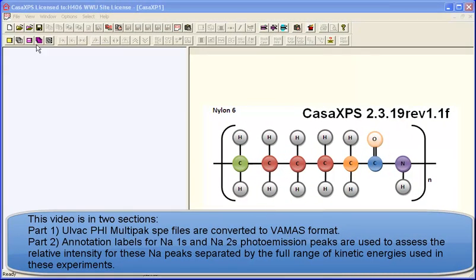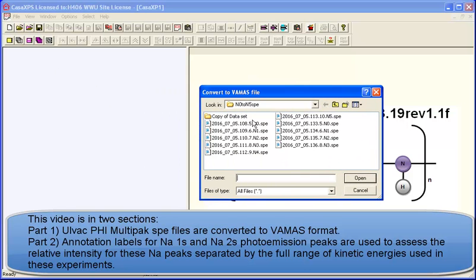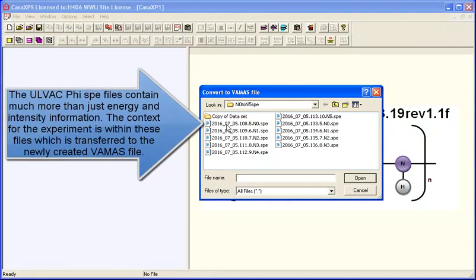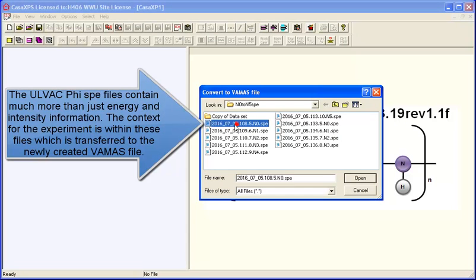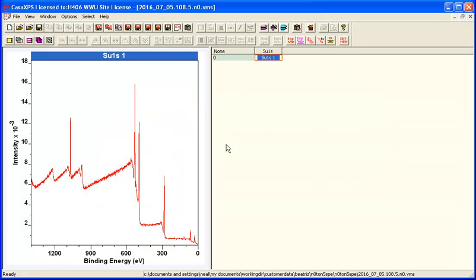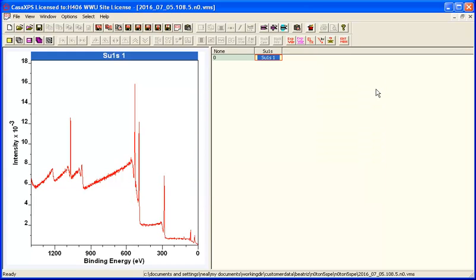The sequence of measurements can be saved as data files in the native format, such as these LVAC-PHI-SPE-Multipack files. If we select one of these in the Convert to VAMAS dialog window and press Open, you can see that a new VAMAS file has been saved in the same directory as the original SPE files and has been opened within CASXPS as a VAMAS file.